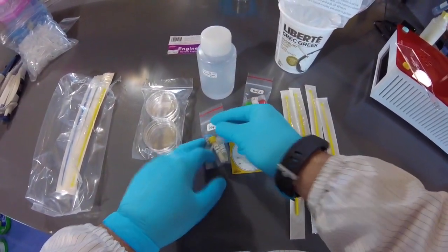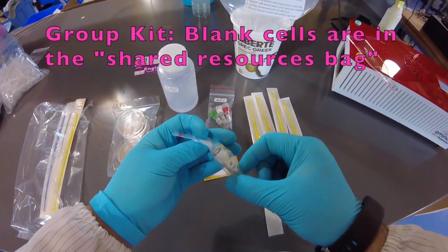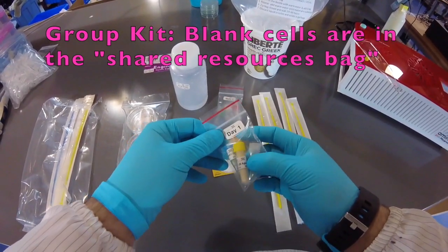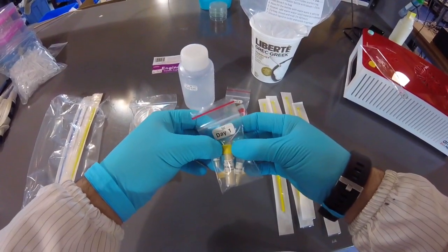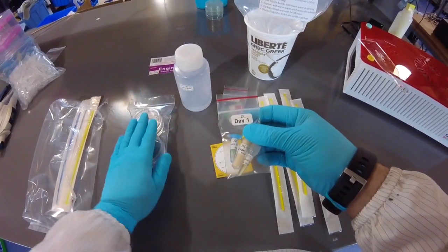Okay, we have the day one bag, which we're going to use today. This comes with some blank cells. These are cells that haven't been engineered yet. You can learn about them in Chapter 3 of Zero to Genetic Engineering Hero. We've got some LB agar powder, and again, this is kind of like Jello. We're going to mix it in the water and then pour it into these plates.